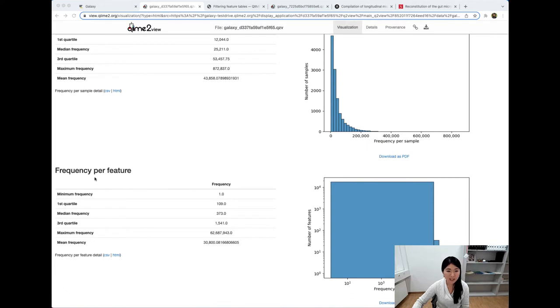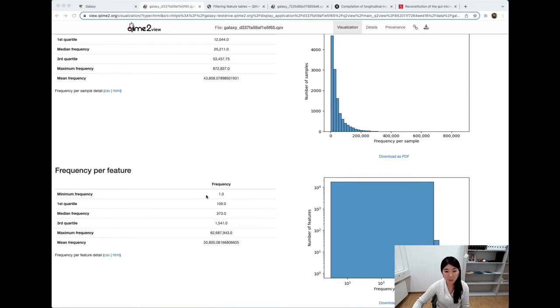We can also take a look at how often each feature shows up. A single feature might show up in a single sample once or multiple times. The minimum frequency of a feature is one, but on average the mean feature tends to show up 31,000 times across either one or multiple samples. That's pretty impressive.